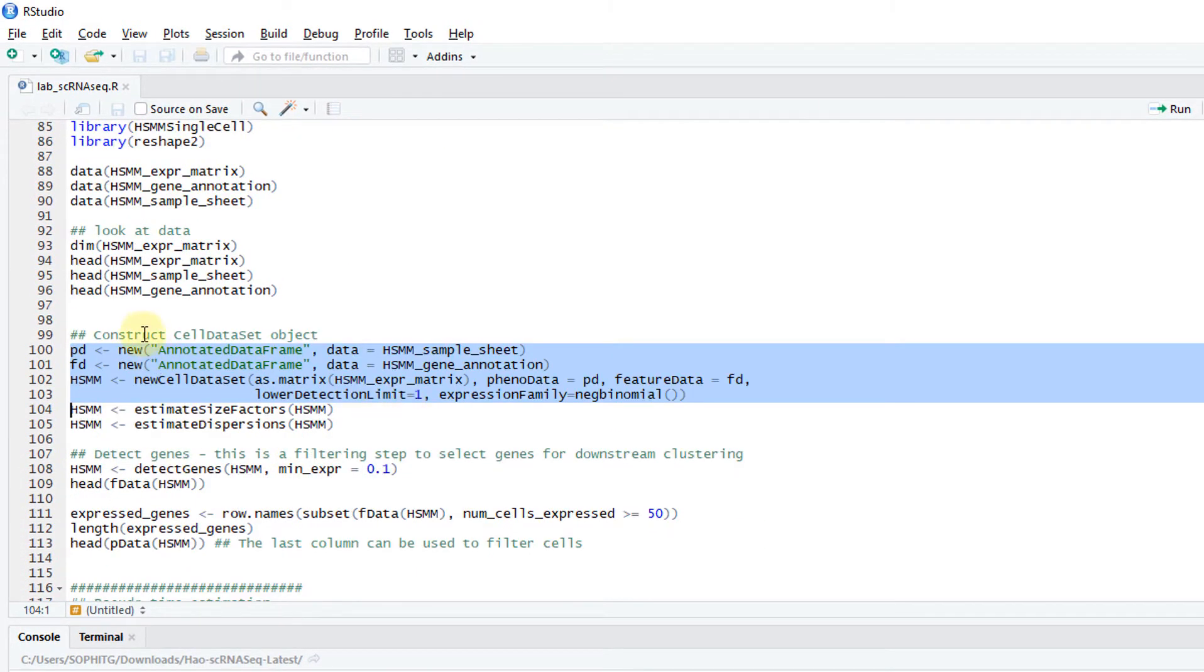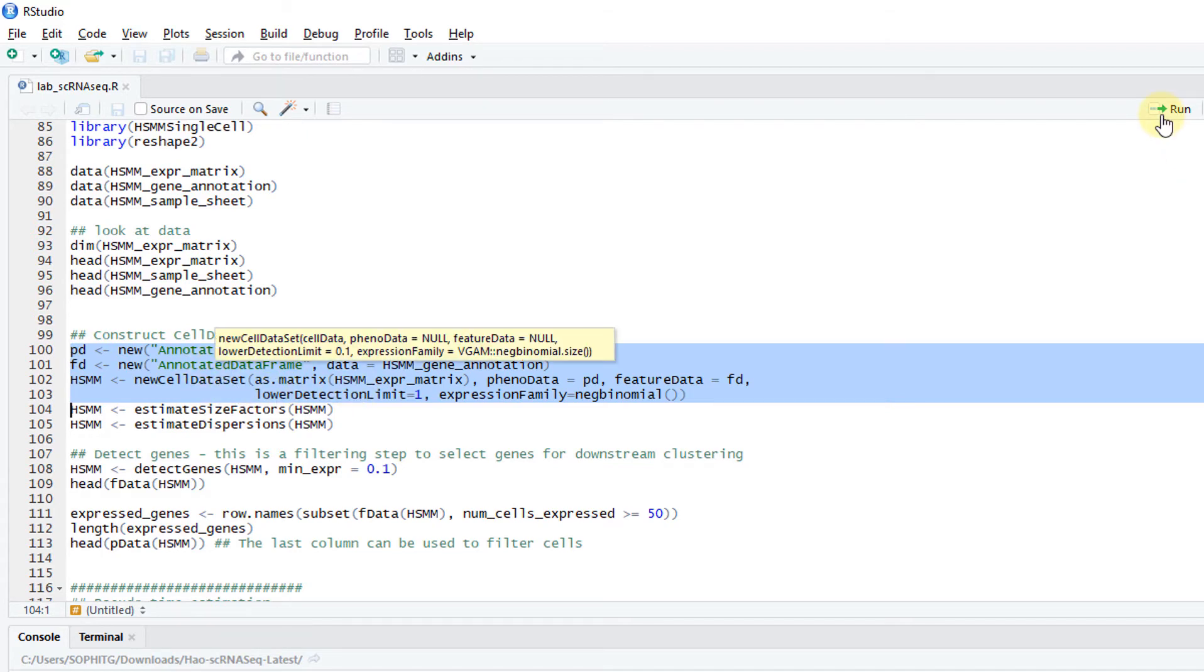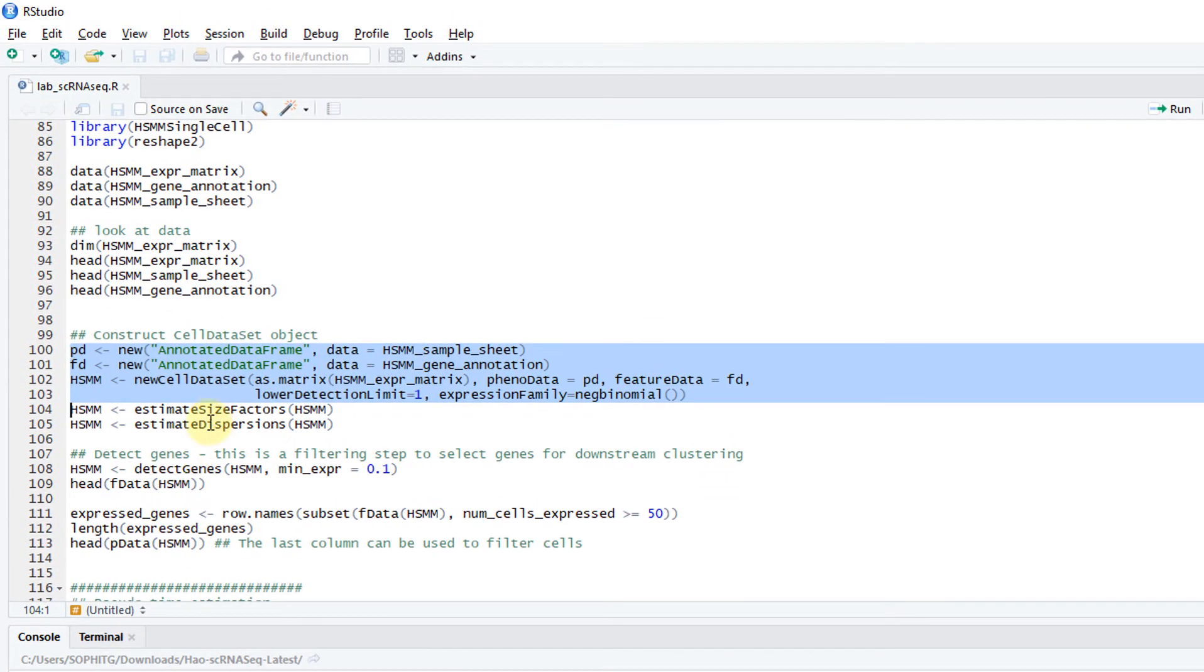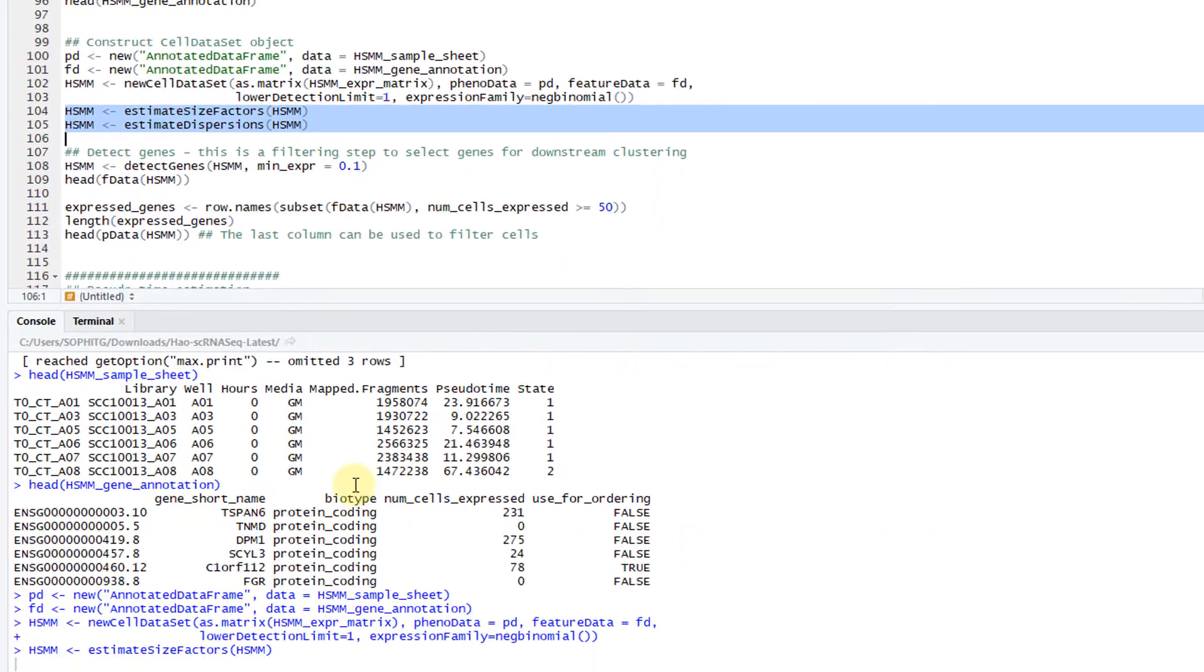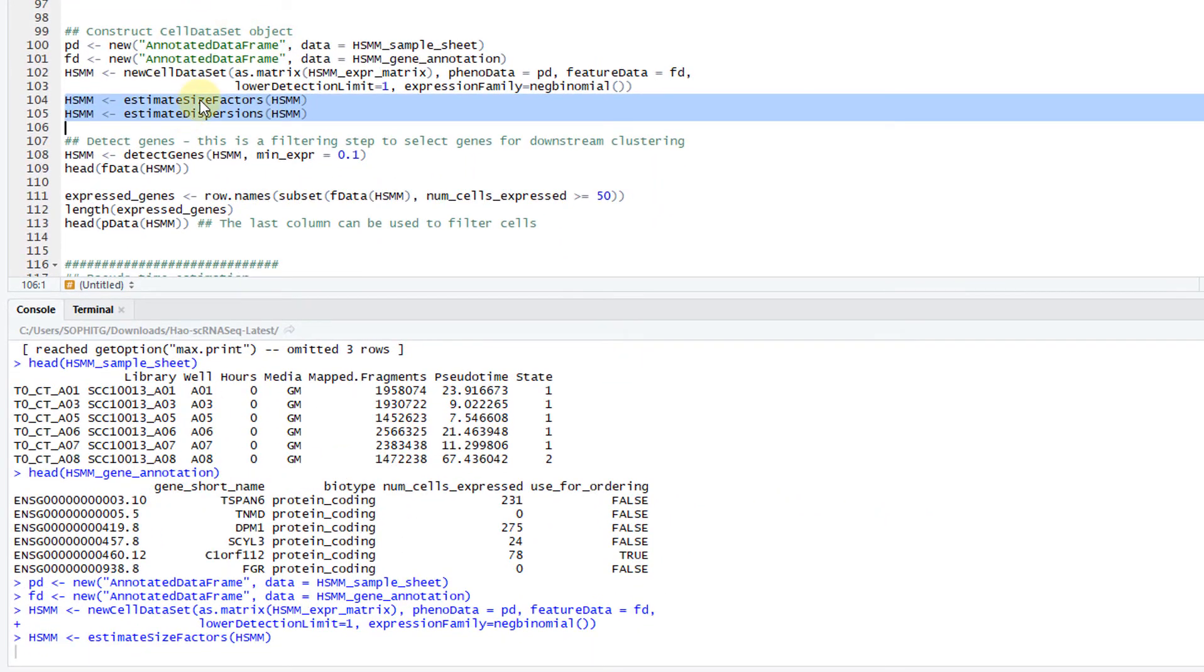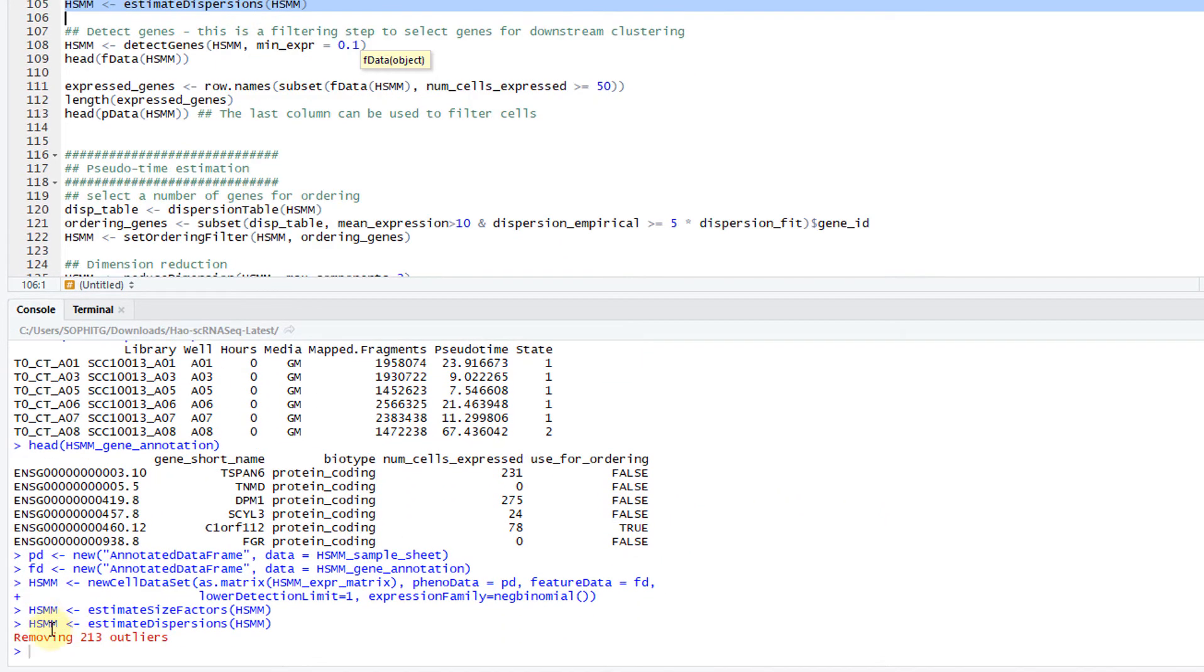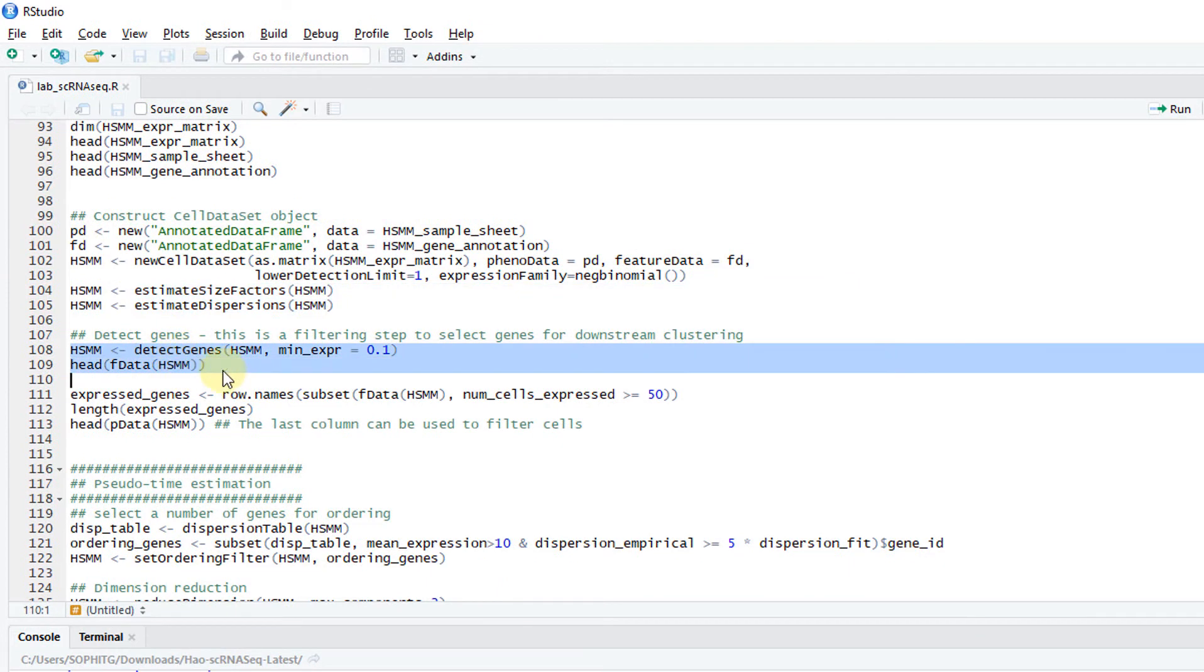Next, you want to create the cell dataset object. You have a PD and FD, basically annotating the cells and the genes. You create this dataset. Then you estimate the size factors and dispersions. These are kind of the normalization steps. It says removing some outlier genes. Then you detect genes.